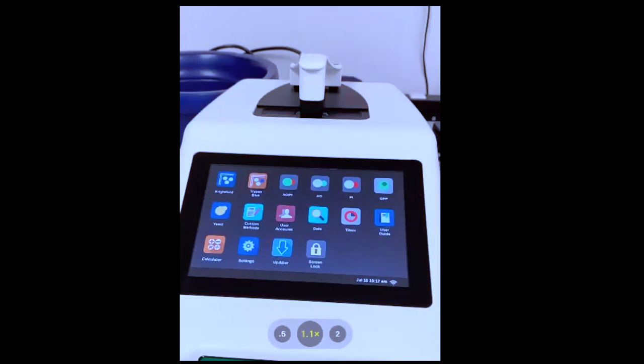So if the cells are big enough and the occlusion bodies are big enough within the cell, you might be able to set the count parameters to count occlusion bodies within that cell. I don't know anyone who has done that before, so I can't say for sure. But it could be possible, and I think it would be worth trying in a demo.